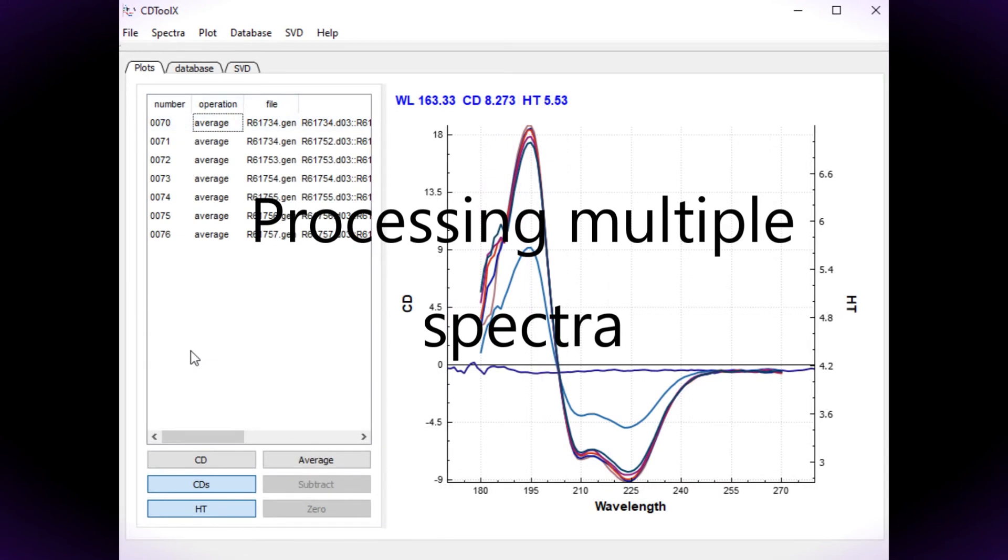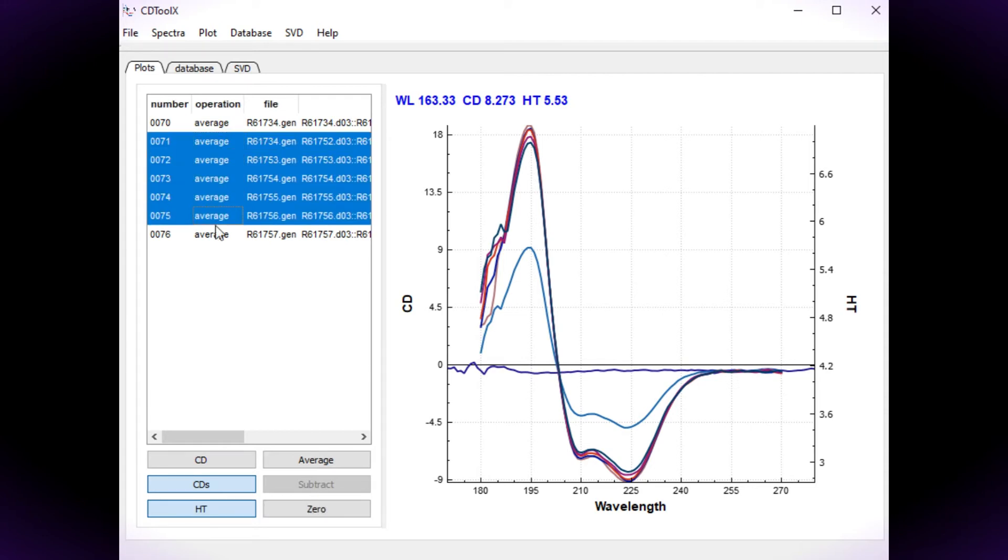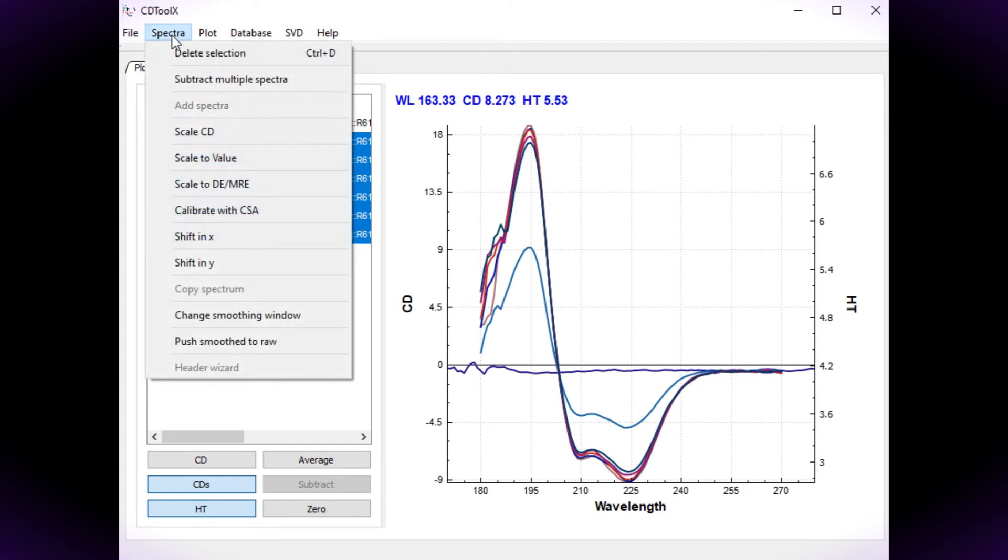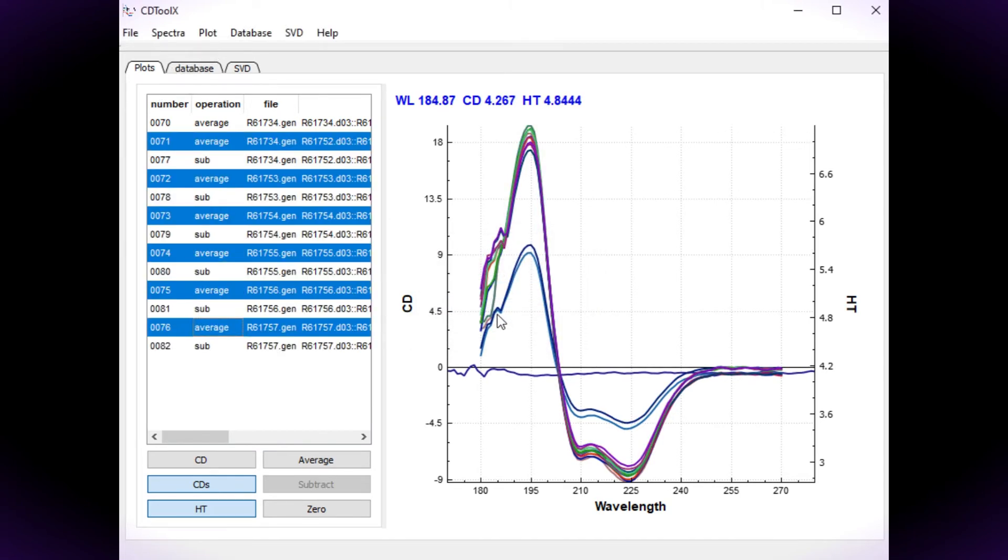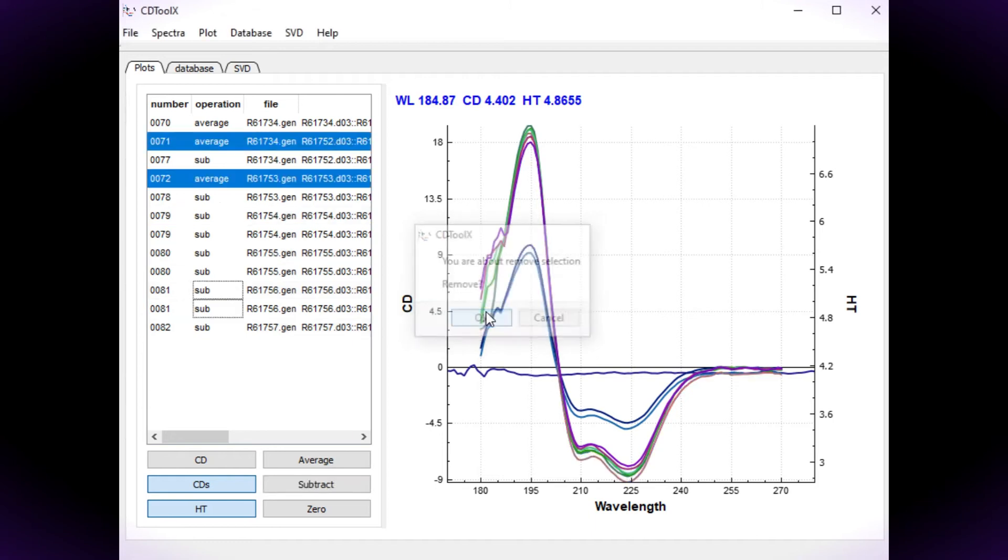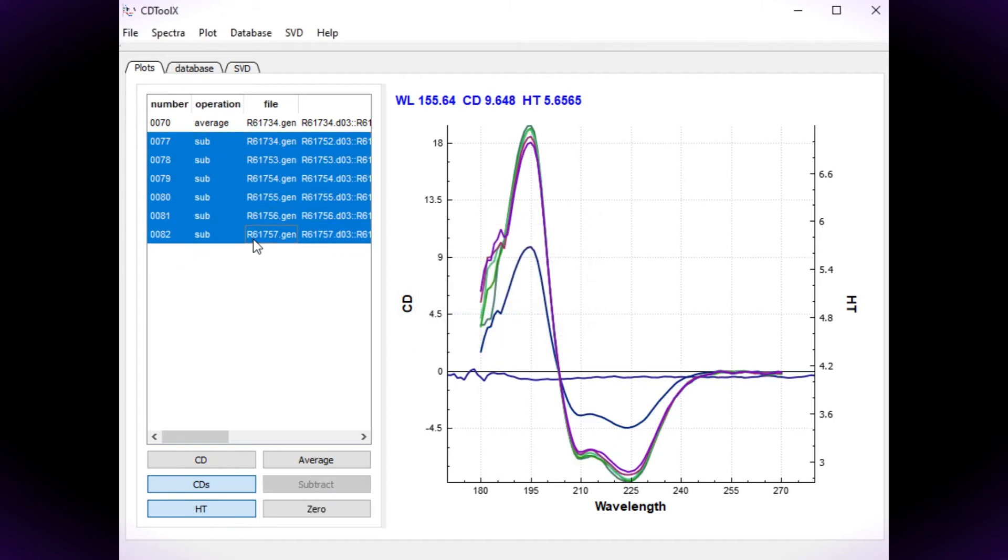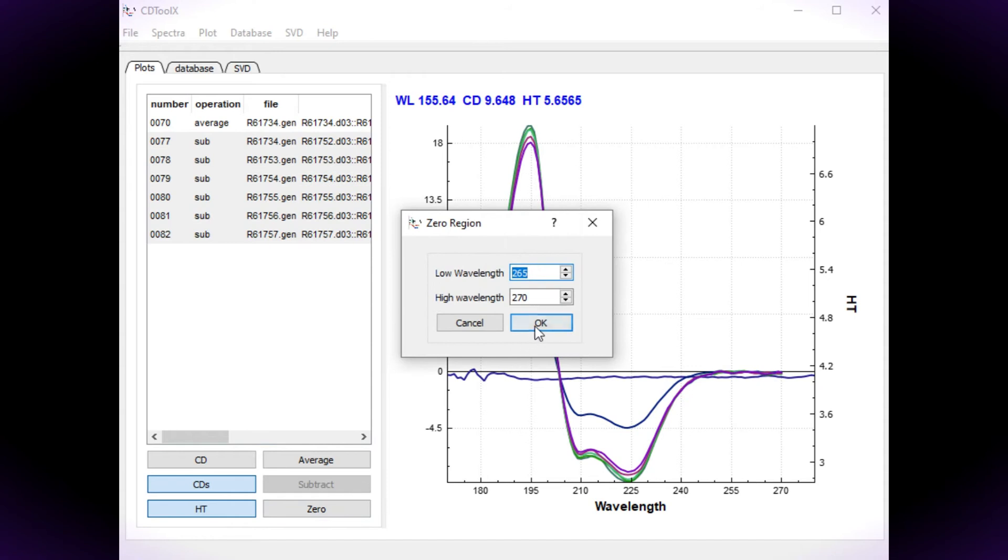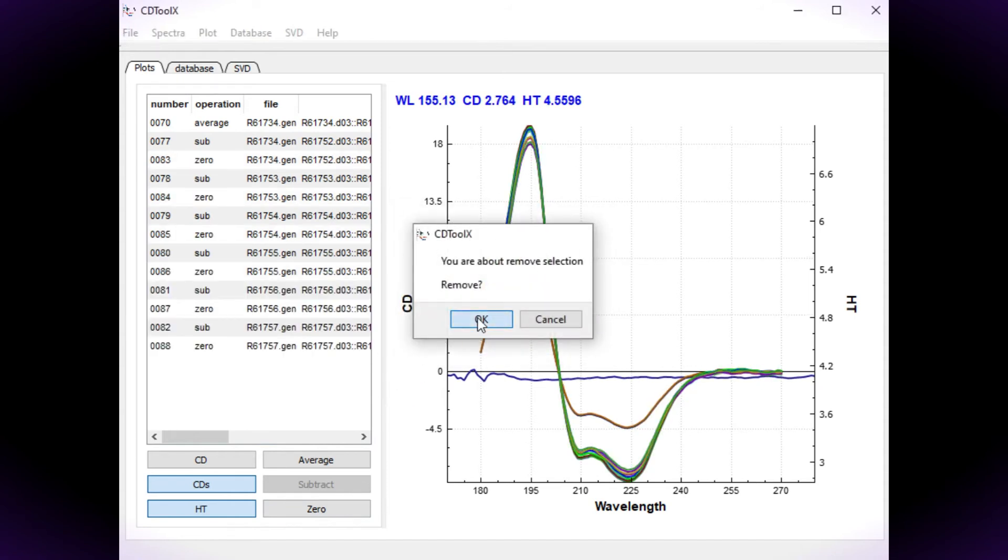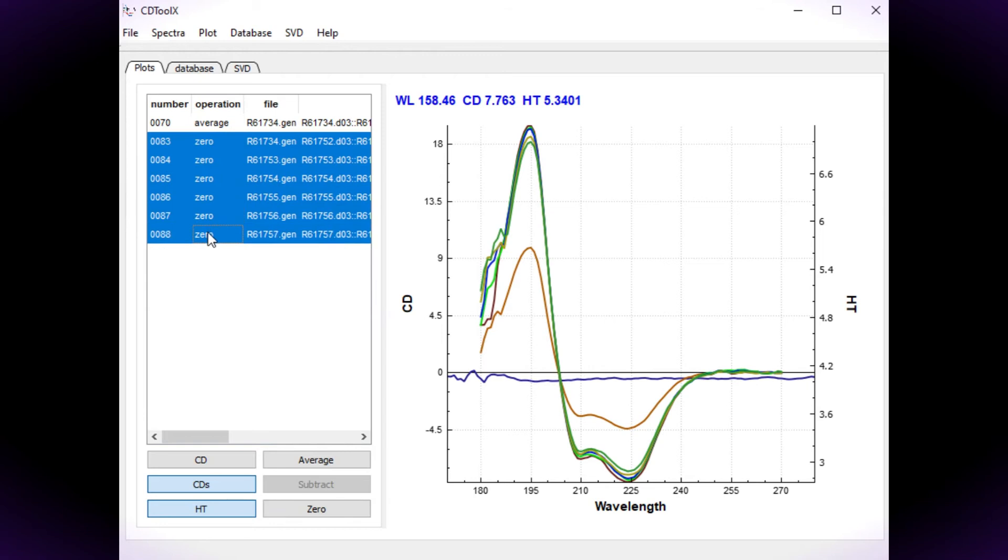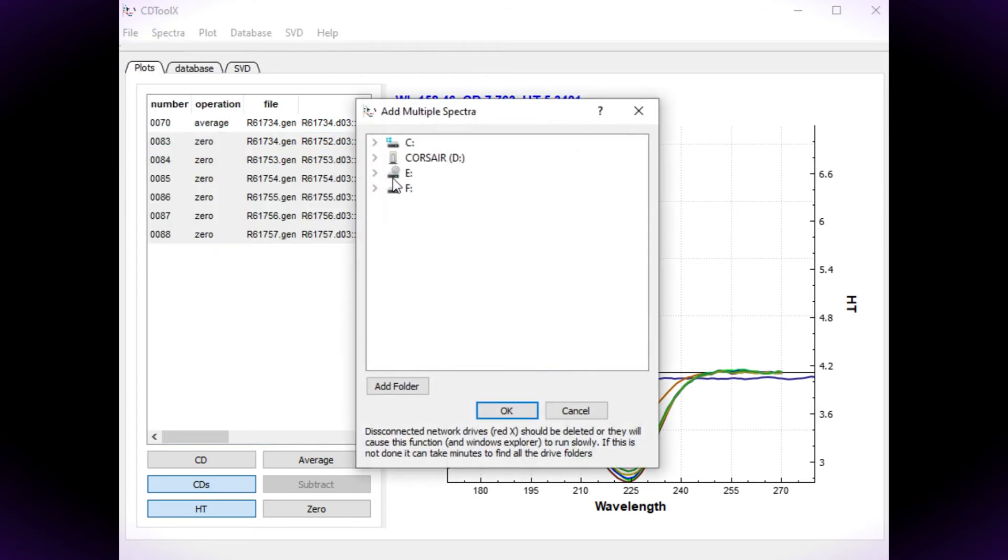Baseline subtraction can be performed on multiple spectra if they have the same baseline. Select the average sample data and choose subtract multiple files from the spectrum menu. Then enter the number of the baseline spectrum shown in the left hand column of the file list. Choose save multiple spectra from the file menu.